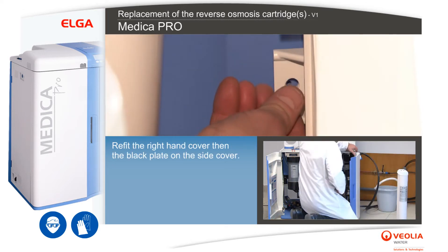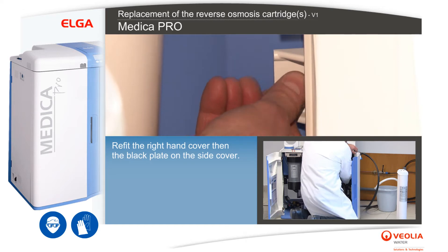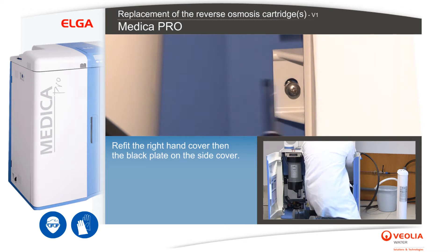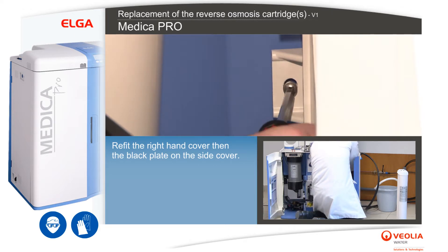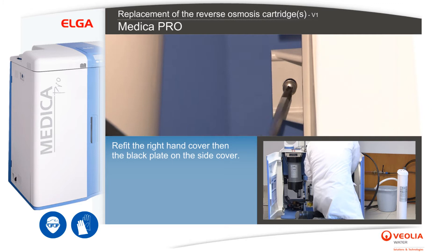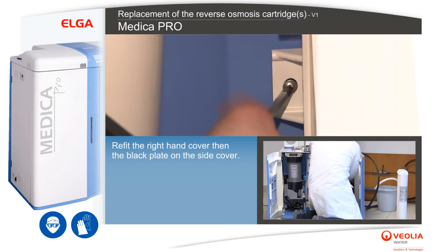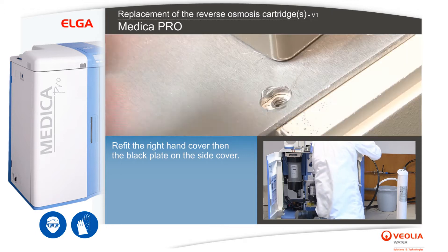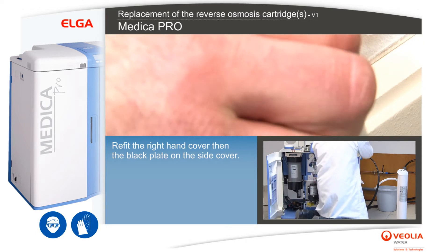Refit the right-hand cover, then the black plate on the side cover.